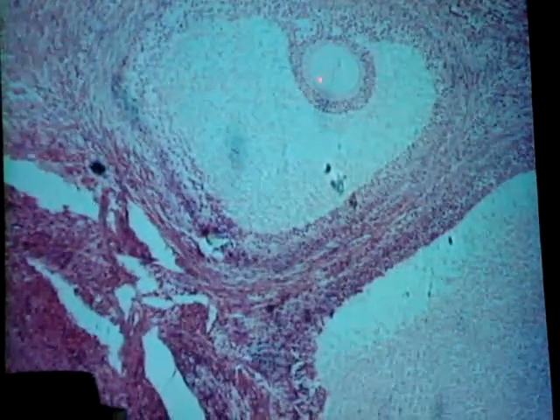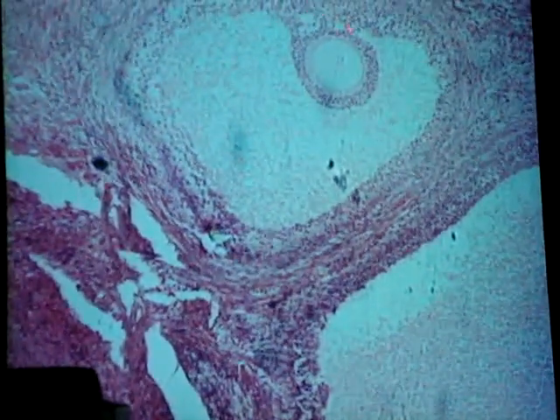And then what the whole oocyte, the zona, and the corona here are sitting upon. Now it looks kind of weird because it's from the top, but it's attached here with the cumulus oophorus. Cumulus oophorus.